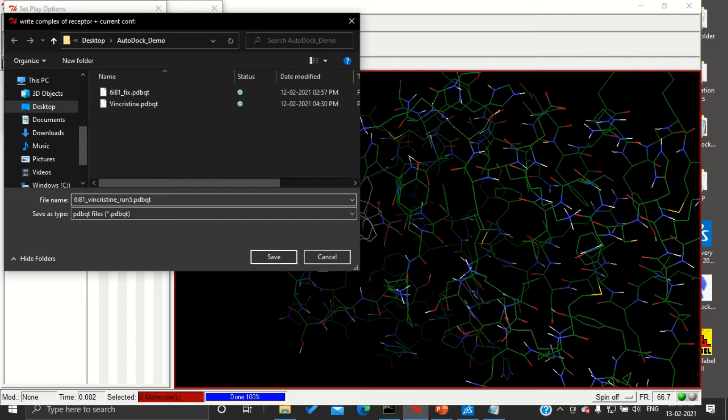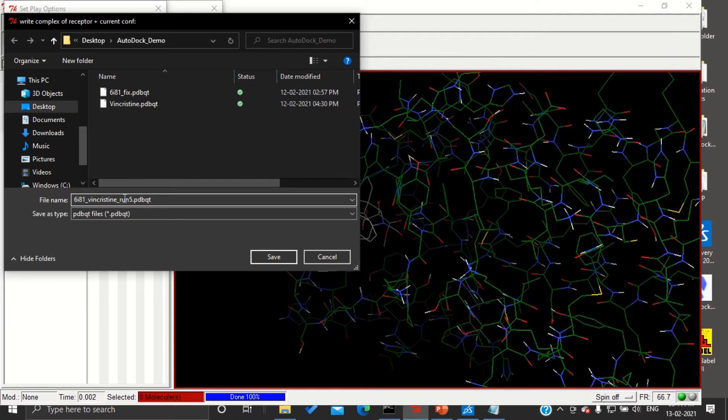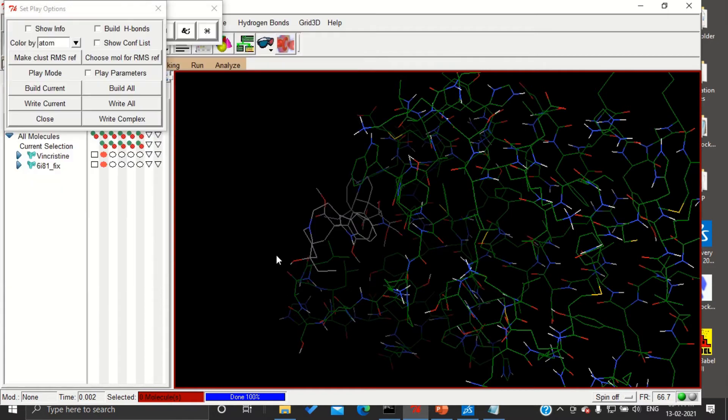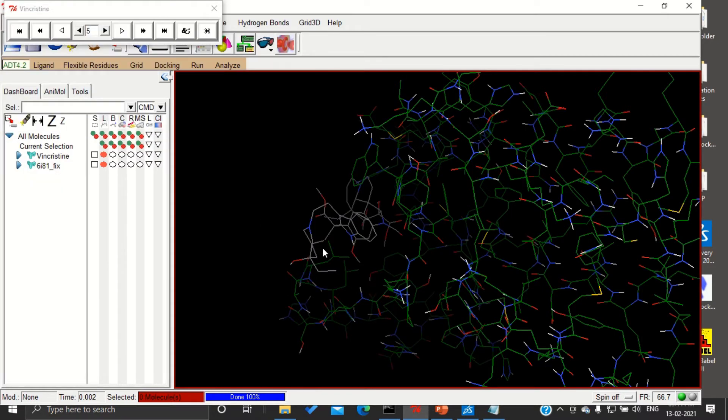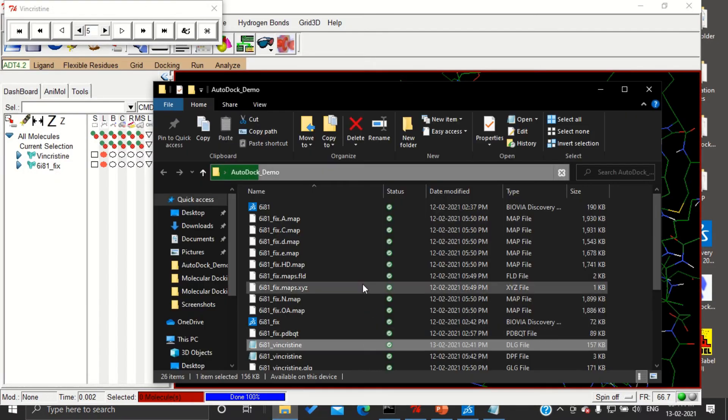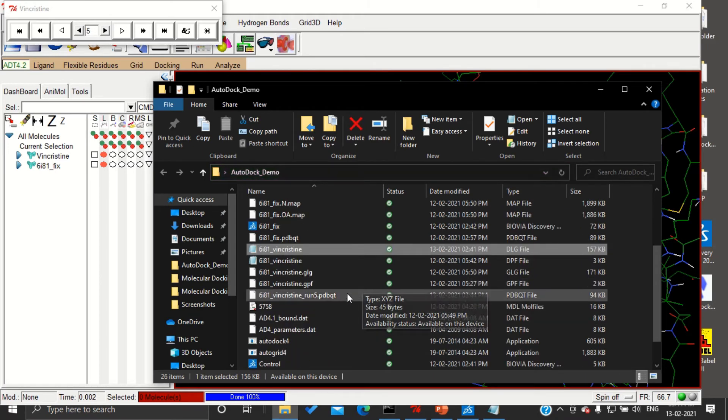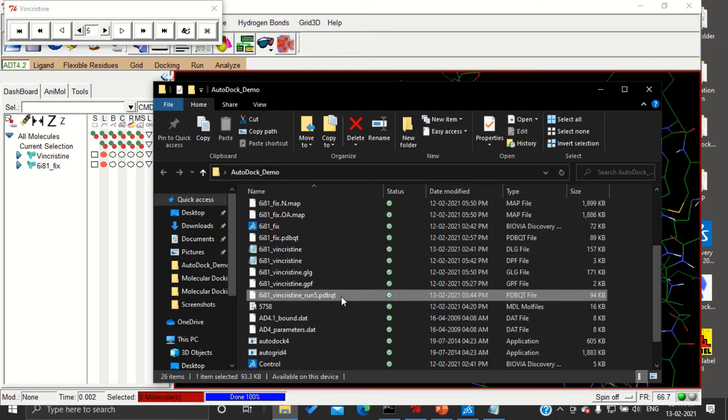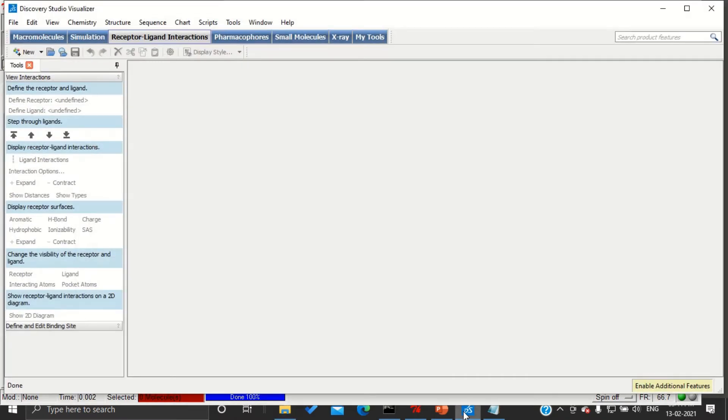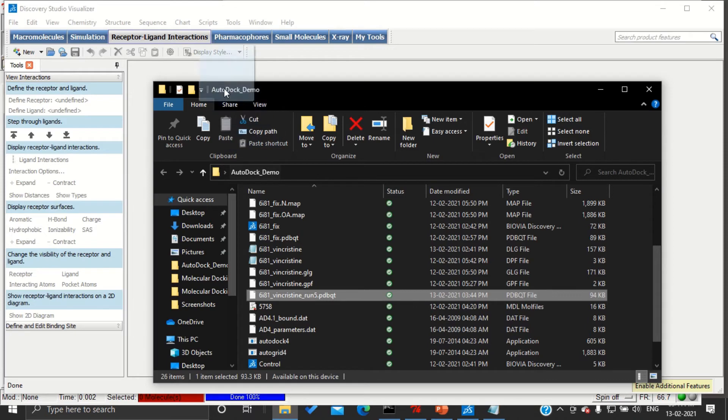I have given this name for my understanding. You can give any name. If we see this, we can understand which protein binded with which ligand and which run was perfect. Once you press save and then close, you can see run 5 pdbqt in your working folder. Now open this run 5 in Discovery Studio.